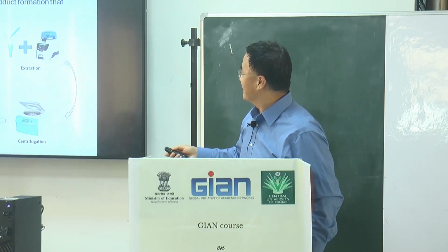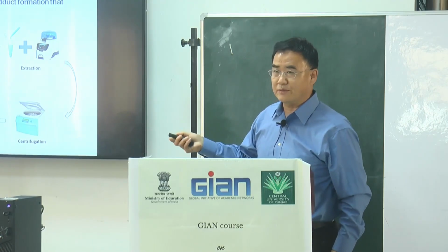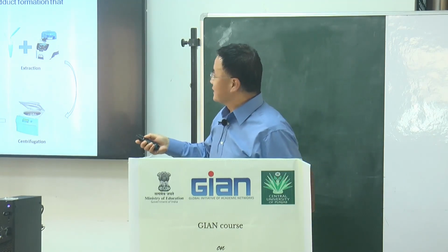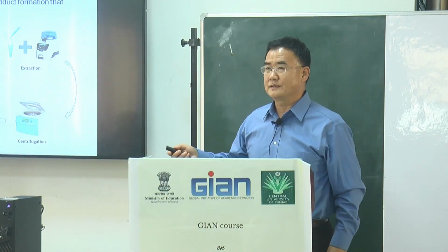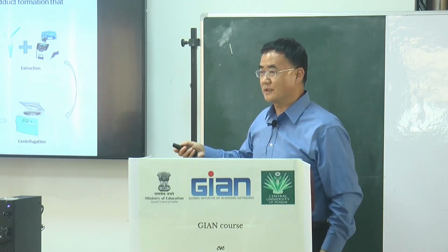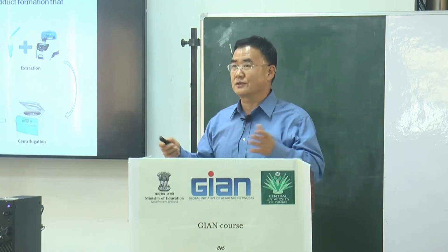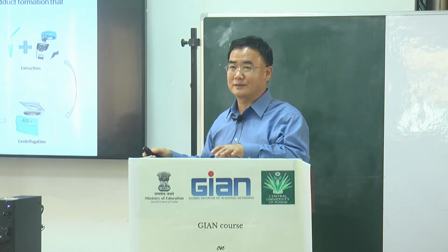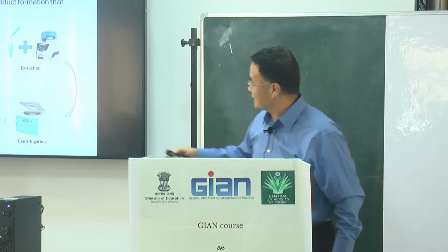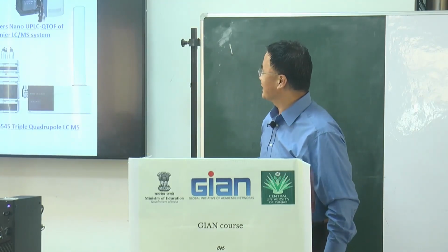That's why, not only for the sampling process but also for the machine, we should apply the one best suited to reach your research goals. We will talk about crossover and mixing the methods, not exclusively only LCMS or only GCMS. That's actually not the reality.